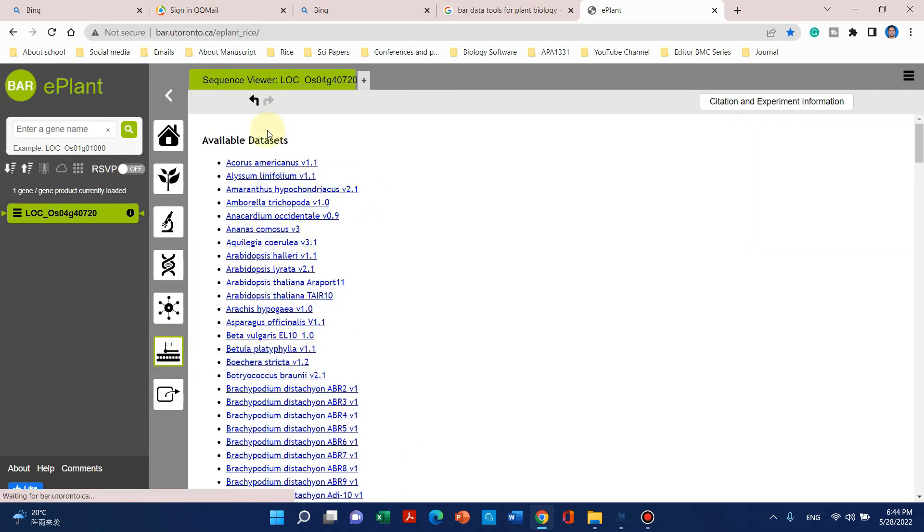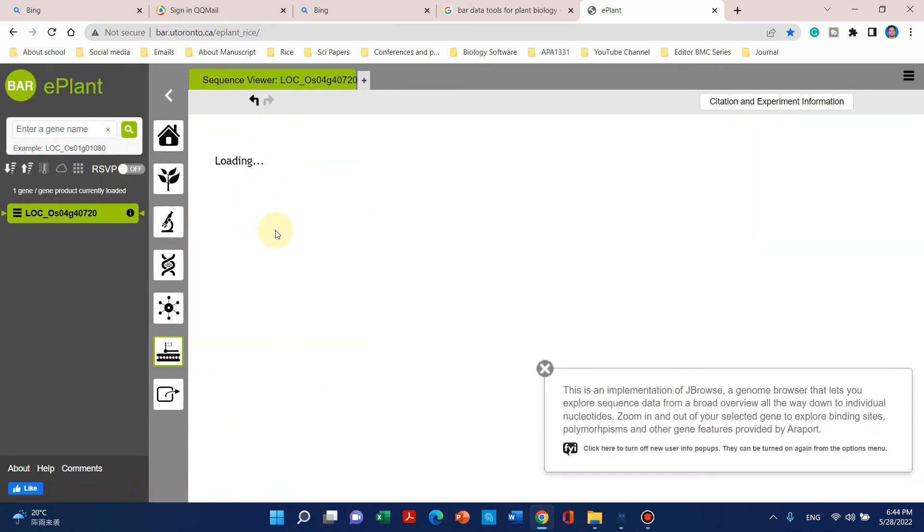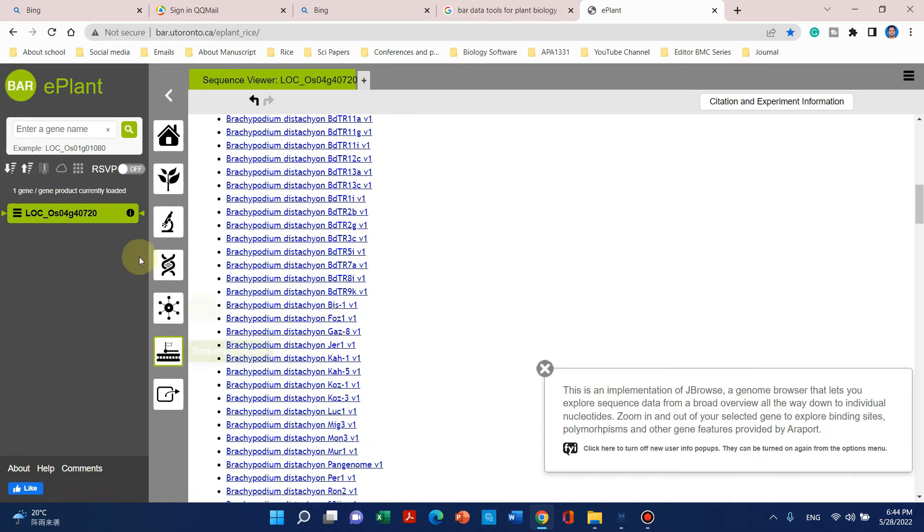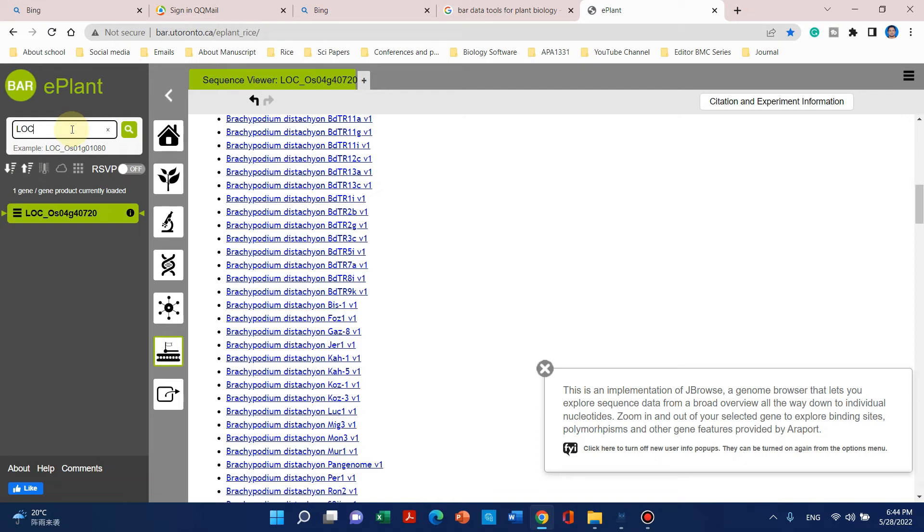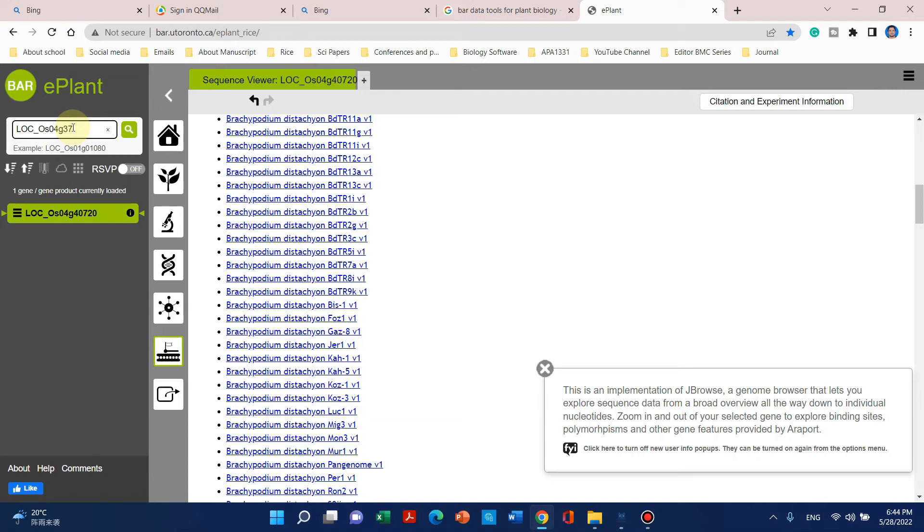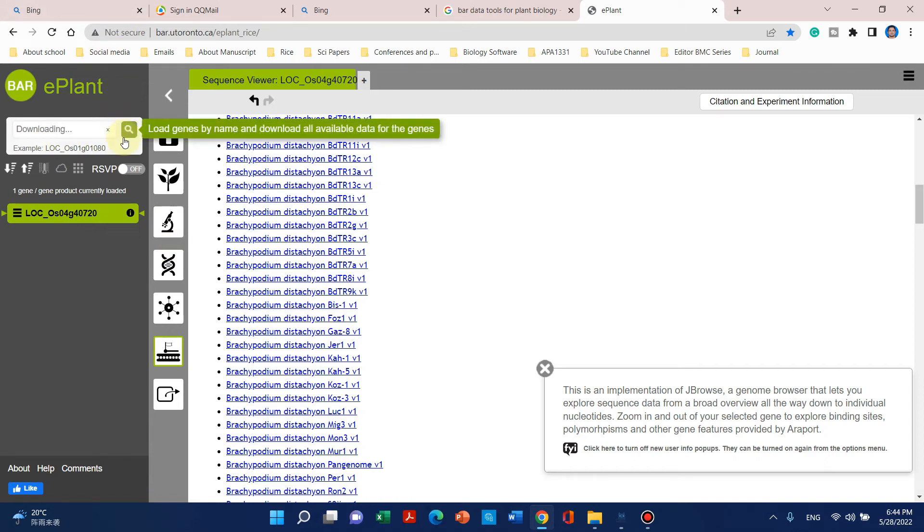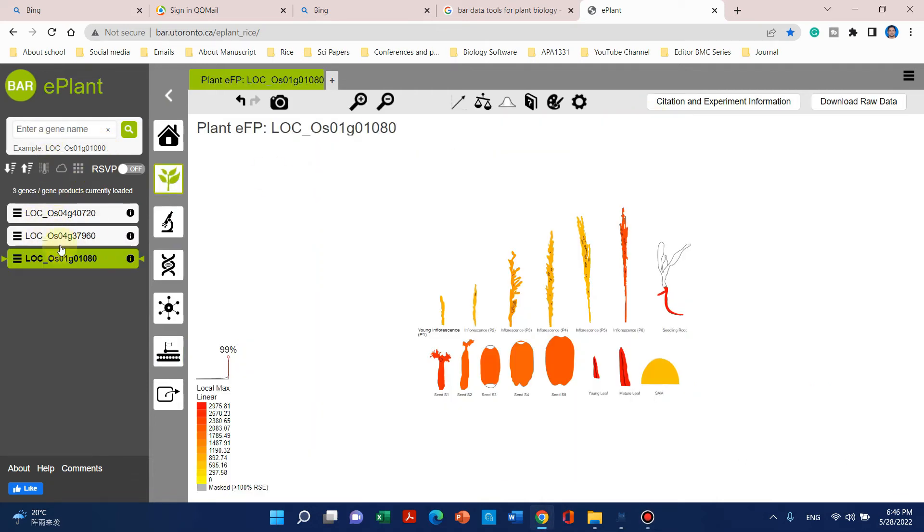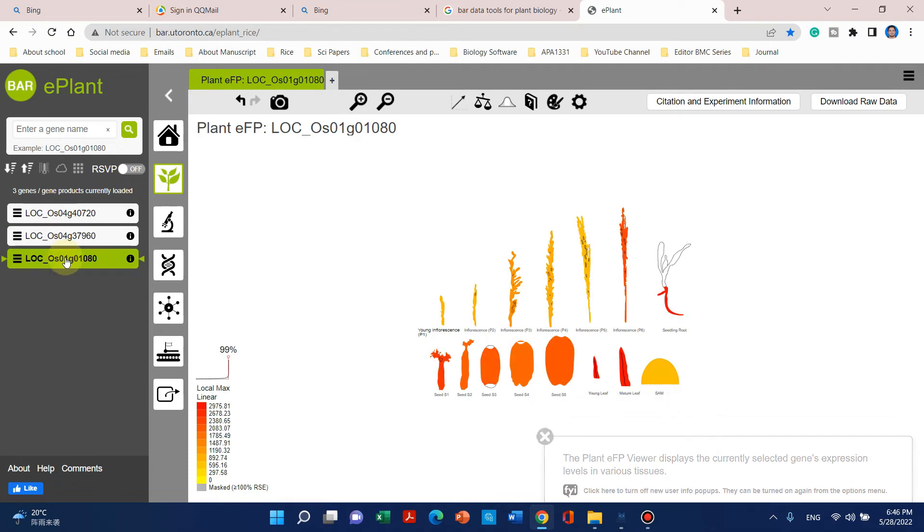You can see its sequence in different databases and its similarities. Now let's try to get another gene ID—LOC_Os04g37960. When you click on this, we can see that I have entered three genes and all of those genes' expression is shown here.